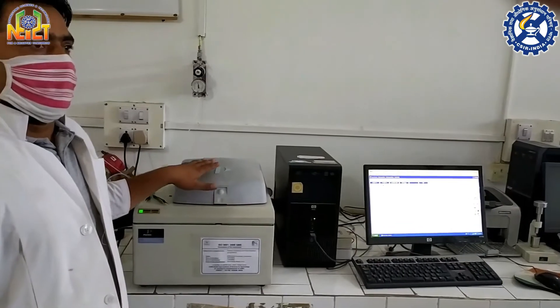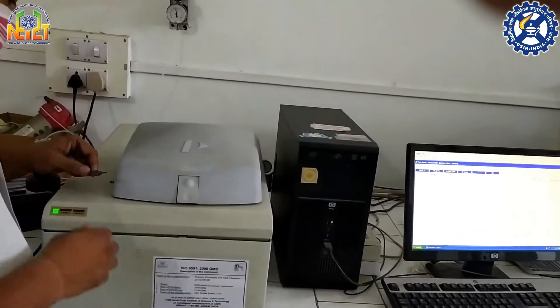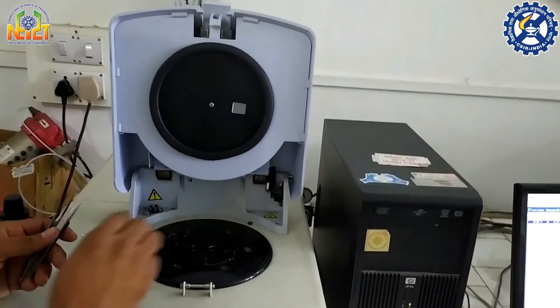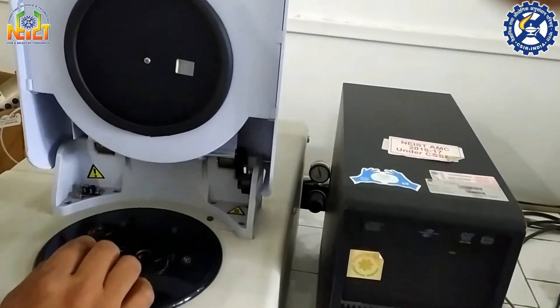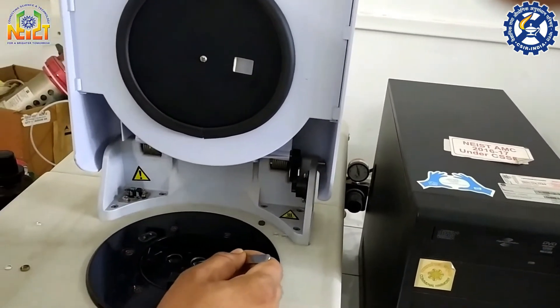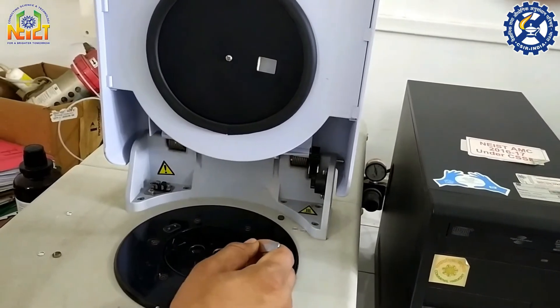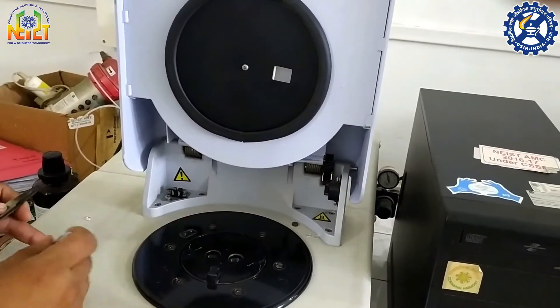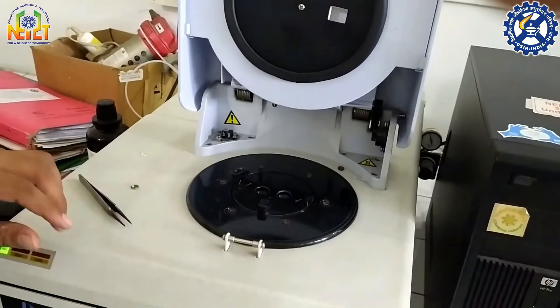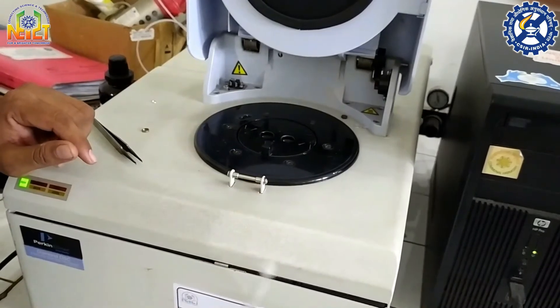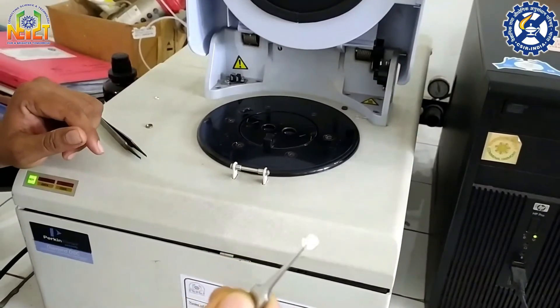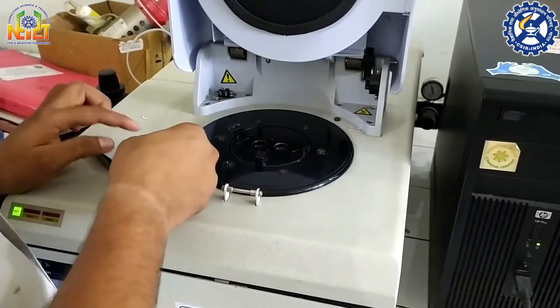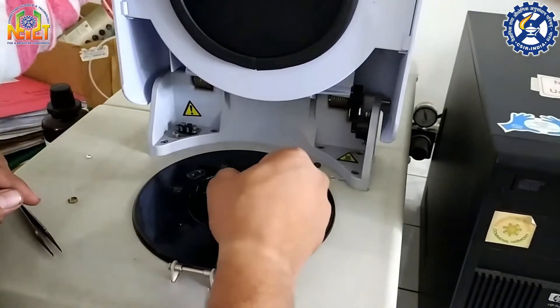Now I want to show how to operate this instrument. As you can see, there are two funnels — the right funnel is for reference and is left empty, and the left one is for the sample. This is an aluminum pan in which our sample is present. The weight of the sample is 2.5 milligrams. Now I am placing this aluminum pan into the sample furnace.